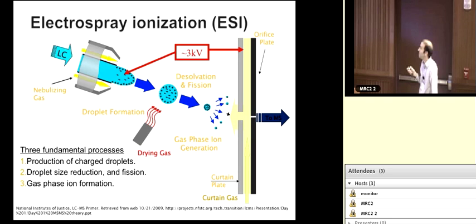Okay, and so then you've got a charged particle. You can manipulate an electric field. You have some sort of a metal plate or cone or something that's your inlet to the mass spectrometer, and you draw those particles in. This is all done at atmospheric pressure.